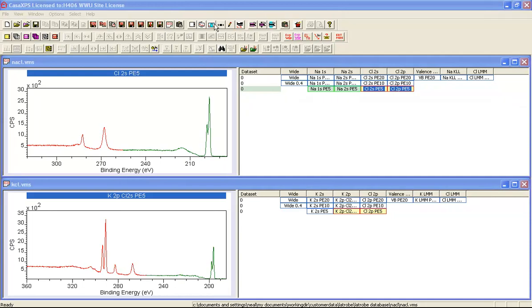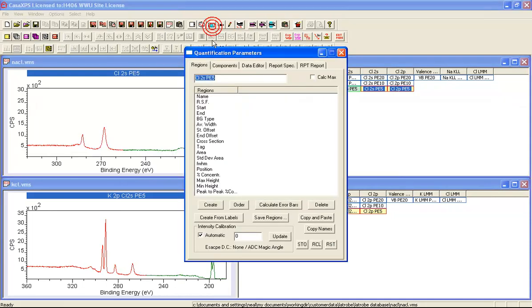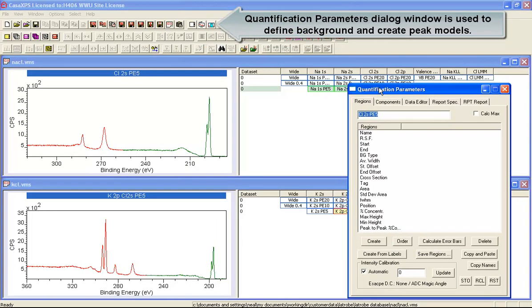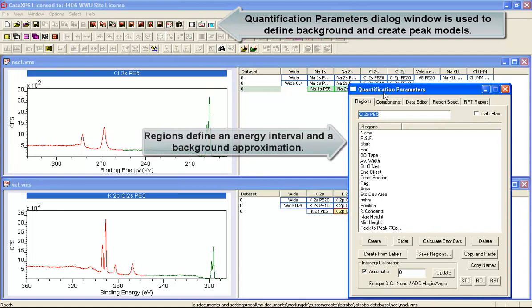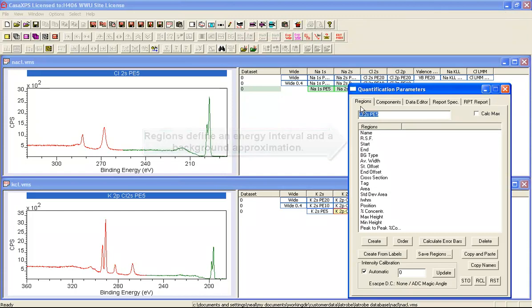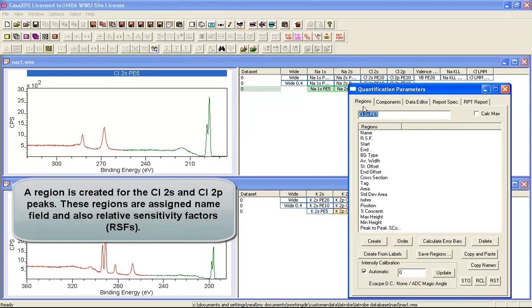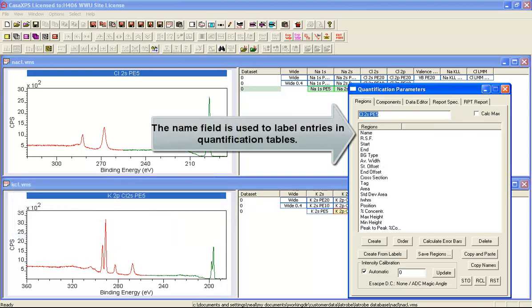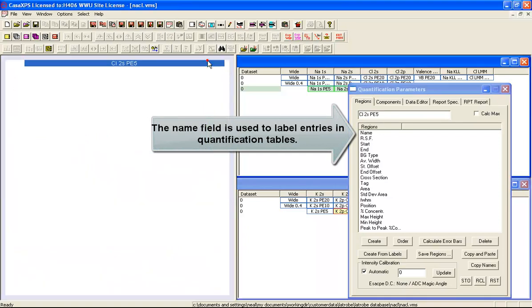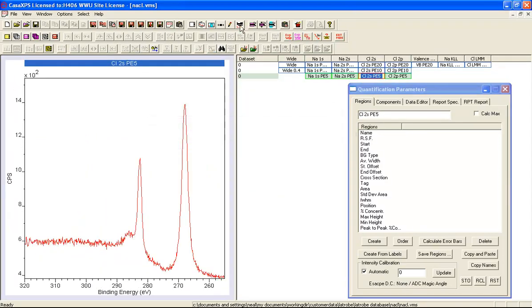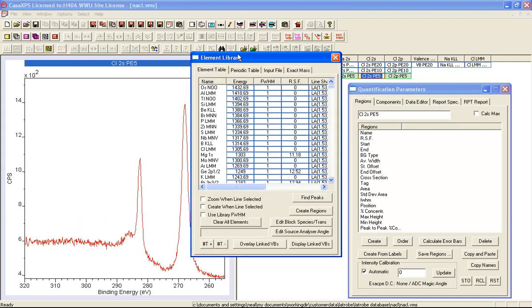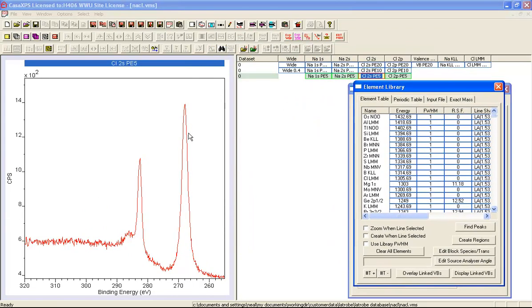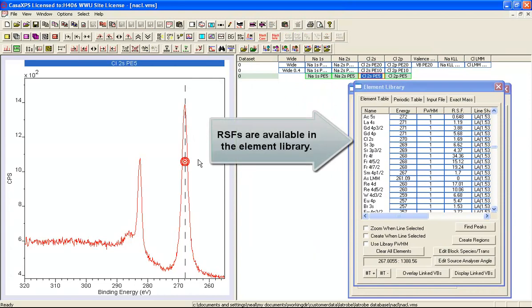The basic mechanism for quantifying data is the quantification parameters dialog window. The idea here is that we create a region on each of these two peaks using the regions property page, and then the parameters that we define using these regions will allow us to compare intensity from the 2S and the 2P chlorine peaks. Let's now focus on the sodium chloride and bring up the element library. The element library contains a set of sensitivity factors. In this case we've got Schofield cross sections.